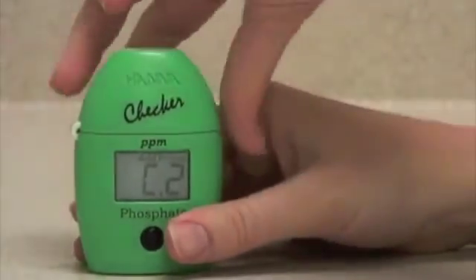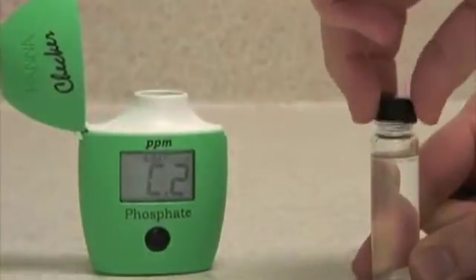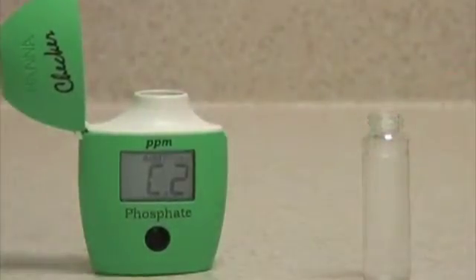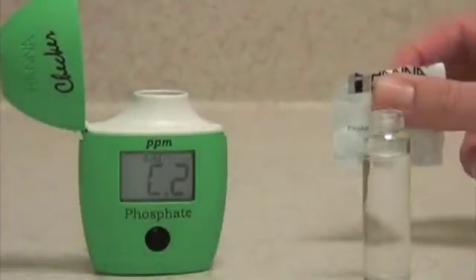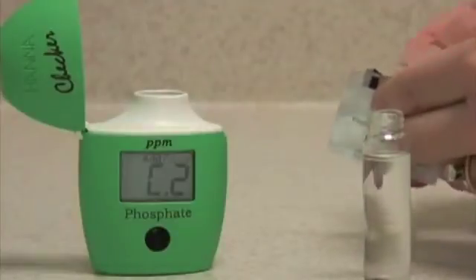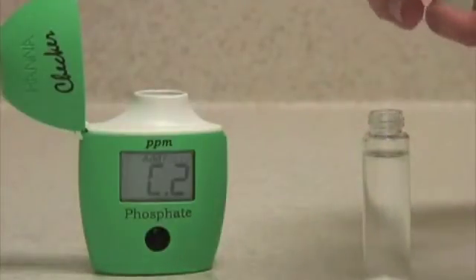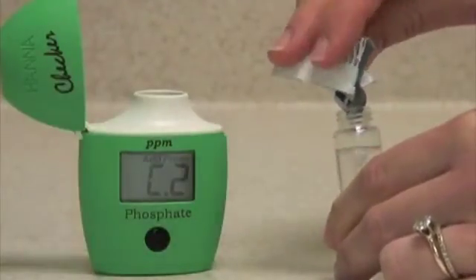when the meter displays C2, you want to add your reagent to this same vial. Try to avoid touching it with your fingers in the middle, as you'll put fingerprints on it that could alter the reading. You take your Hanna Instruments Powder Pack for Phosphate, and pour this powder reagent into the vial. Try and get as much into it as possible.